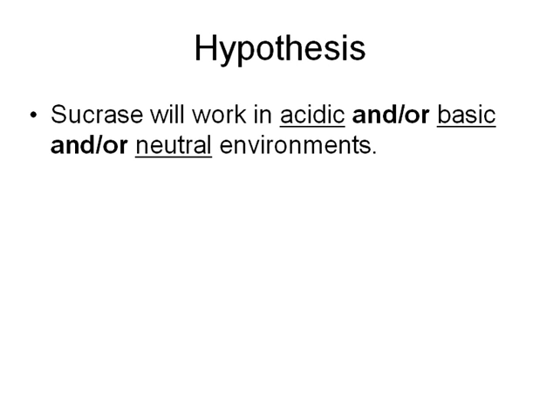To help you out, however, I'll go ahead and tell you that not just yeast, but you contain sucrase as well. And sucrase, which is breaking down sugar, okay, your mouth will break down, so that your saliva contains sucrase, as well as some of your intestinal secretions contain sucrase as well. So think about the pH level of those parts of your body when thinking of your hypothesis.